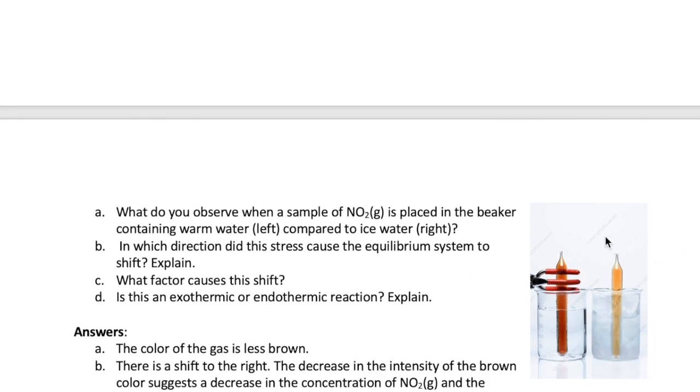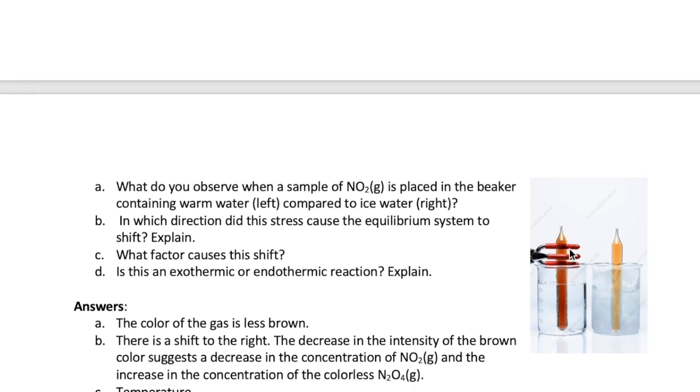So the system that you're supposed to look at is this system right here. We start originally with a tube here on the left where it's filled with a gas. Maybe this picture is not too clear, but this water is warm and then this water has ice in it. So you move it to the ice water.